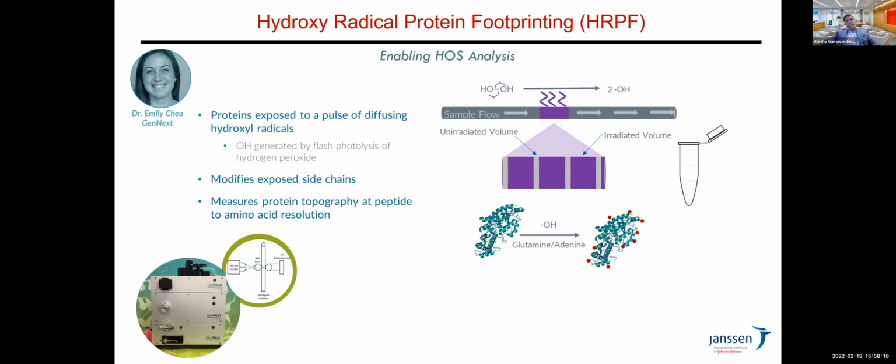Perhaps the most widely used approach relies upon the fast photochemical oxidation of proteins, which is known as FPOP for short, that generates hydroxy radicals using a single high fluence short pulse of UV light. So it uses a laser.